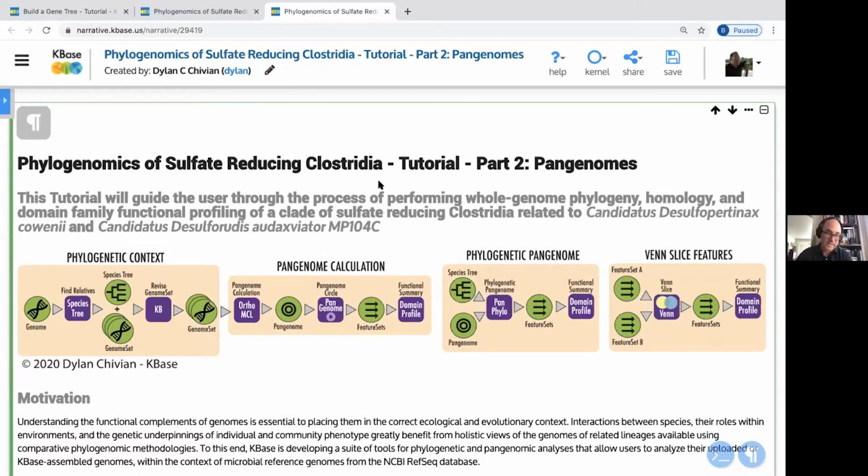Anyway, functional annotation's a whole other can of worms. So we're going to use sequence homology to determine evolutionarily related genes, and then we're going to figure out, across this collection of related genomes, how much those sequence cluster functional homologs are present or absent, or if they're in sub-branches and so on.